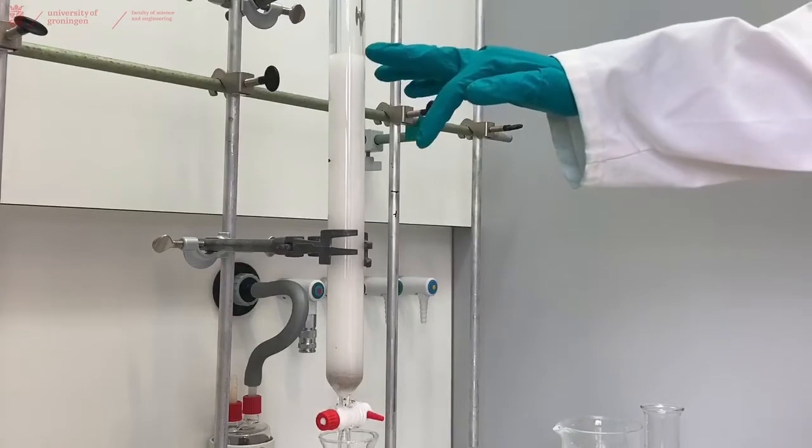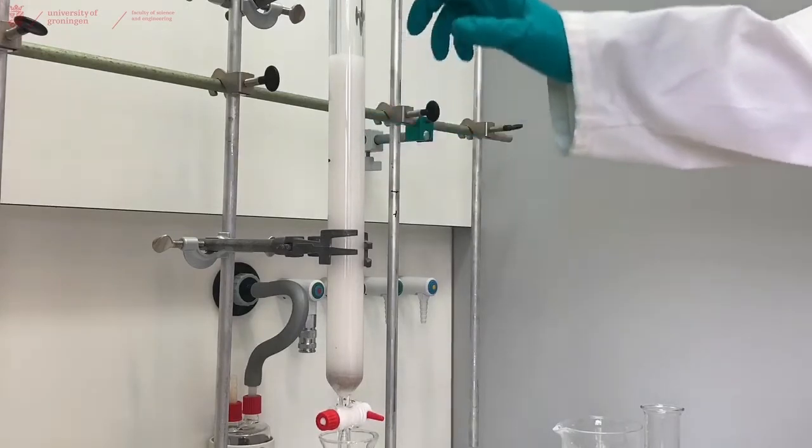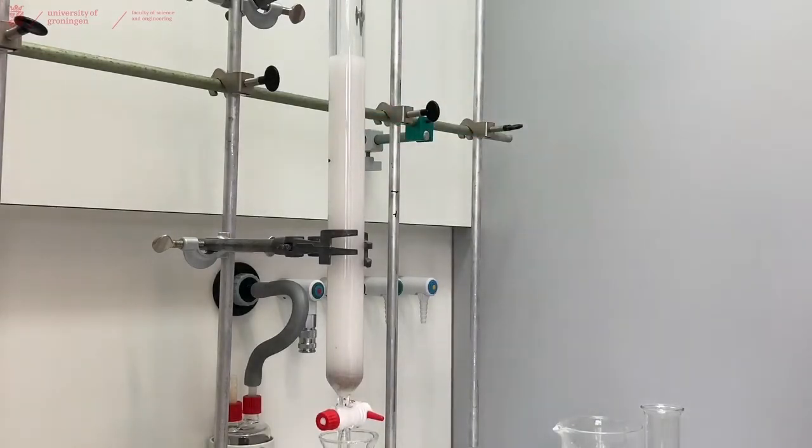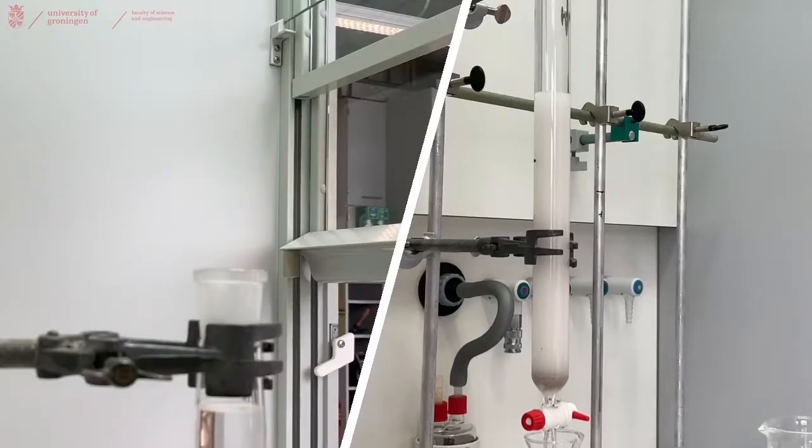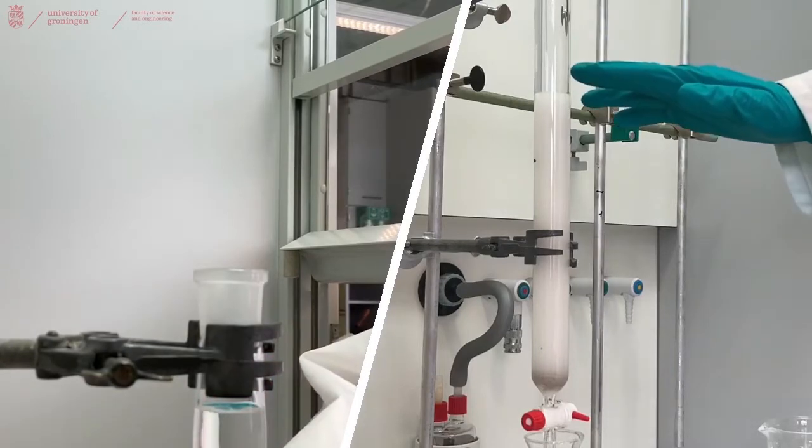As you can see, the silica is slowly settling down in the liquid, but there is still a bit of silica on the top which you can rinse away with a small pipette and some of the eluent. As you see, the settling will take quite some time.